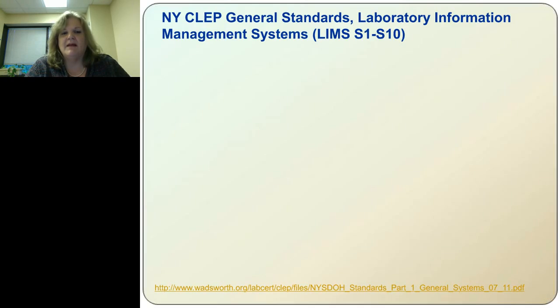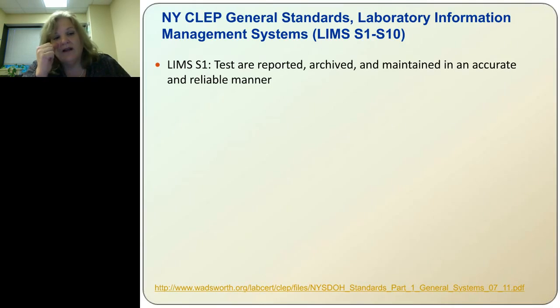I don't know if they're the most detailed of all the states, but they're pretty detailed. One of the things they do go through is laboratory information management system requirements. Some of them they leave up to the laboratory, such as the exact implementation the information management system takes, whether commercial or in-house.